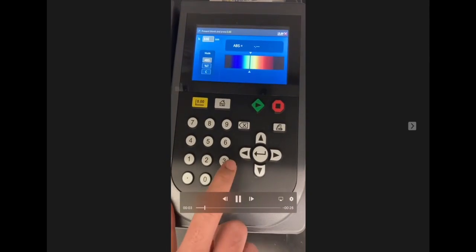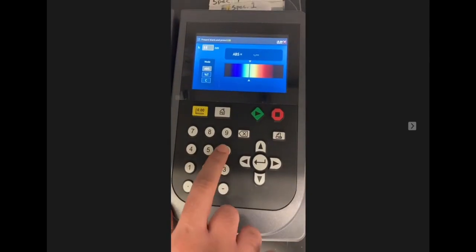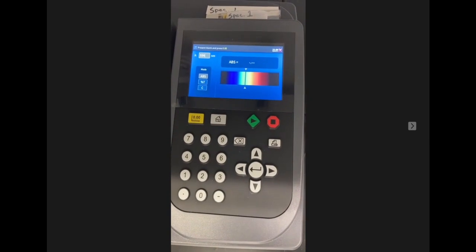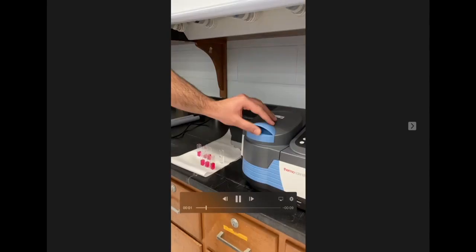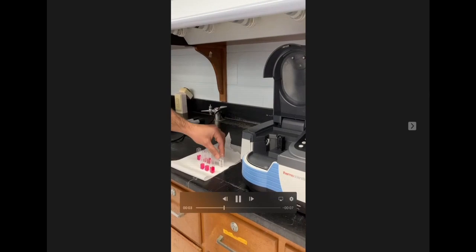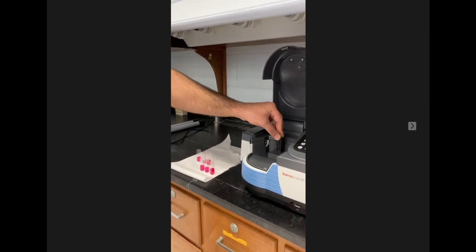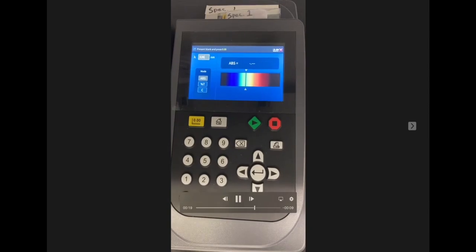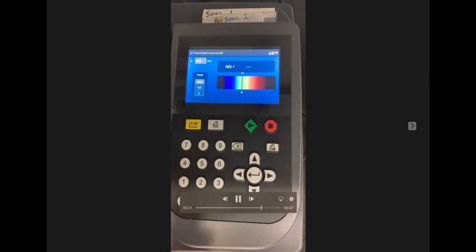The final step is to measure the absorbance of each solution. After turning on the spectrophotometer using the switch on the side, set the wavelength to 536 nanometers. Then place a blank solution in the machine to calibrate. Finally, measure and record the absorbance of your acetone and methanol solutions. It's a good idea to recalibrate the spec after every several runs.